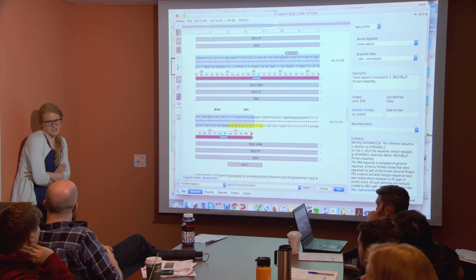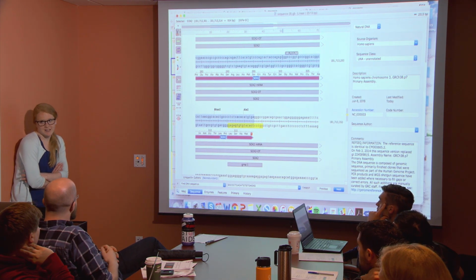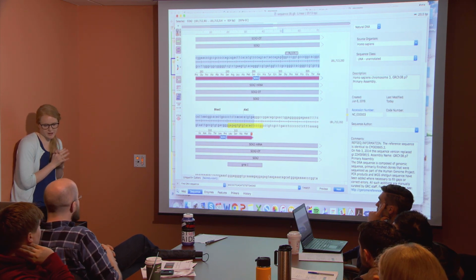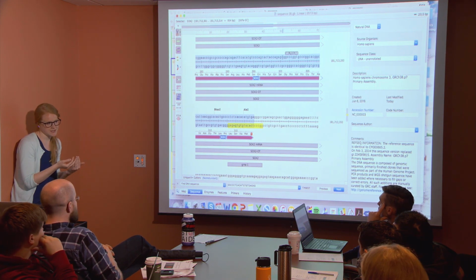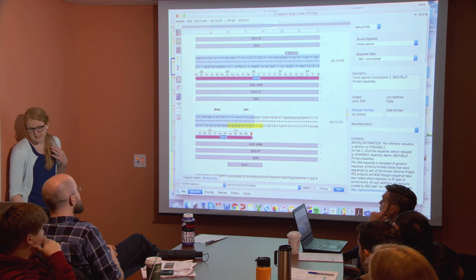So you basically need to sit down with a pencil and paper and go through it and think about the potential options. Think about what region would I PCR out? Where could I introduce a cut that would be a potential screening site, and how can I do that without disrupting this sequence?